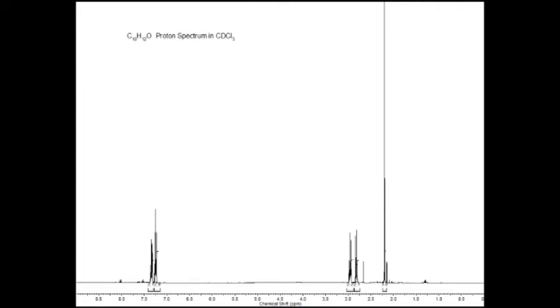Nothing is noted between 5 and 7 ppm, and nothing around 4 ppm at all. No alkene, no protons near an oxygen like you would find in an alcohol, an ester, or an ether. Also, there are no resonances down at 1 or less. We do not seem to have a methyl group at the end of a long chain.